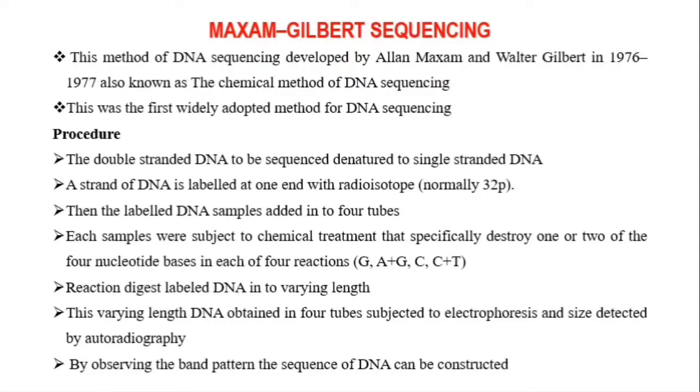In this method, chemicals are used to break the DNA. This was the first widely adopted method for DNA sequencing.